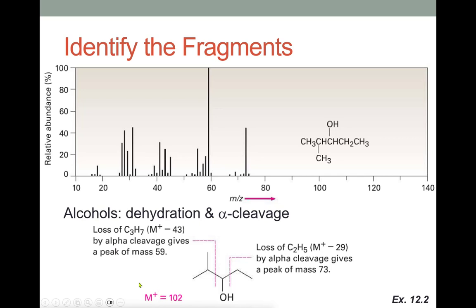So I'm not actually seeing the total mass of 102. And in fact, I'm not even seeing the dehydration product. That would be 18 smaller than this, so 84. And I'm not seeing that here. And that's okay. Remember that we don't necessarily have to see every single fragment.